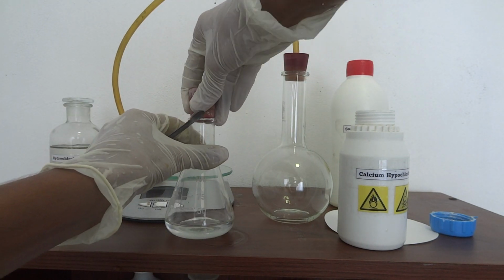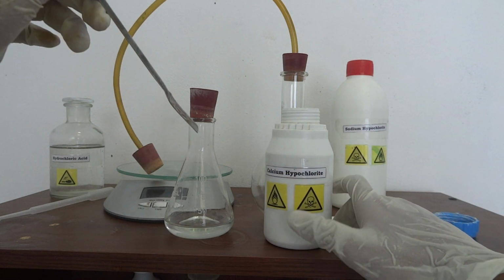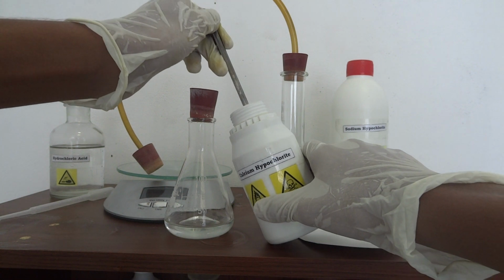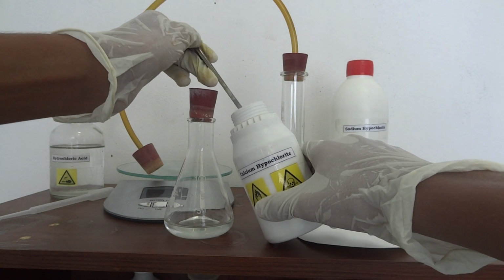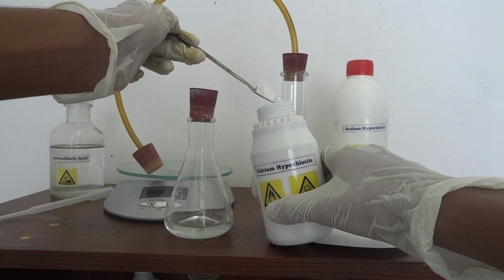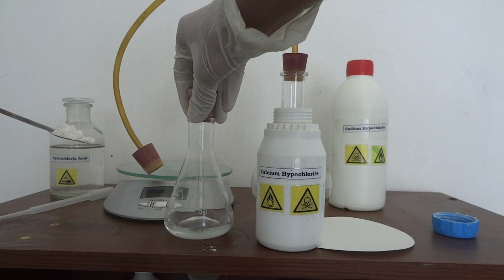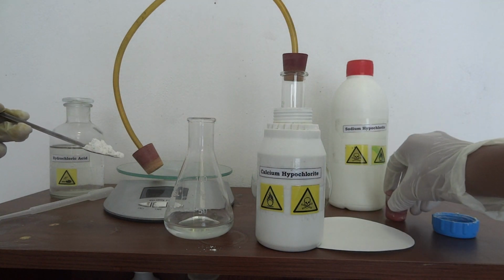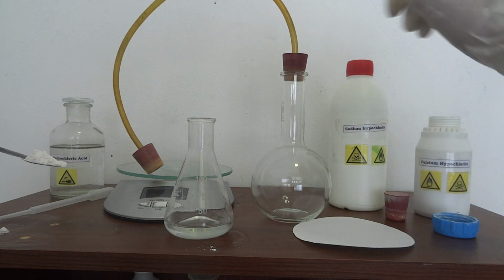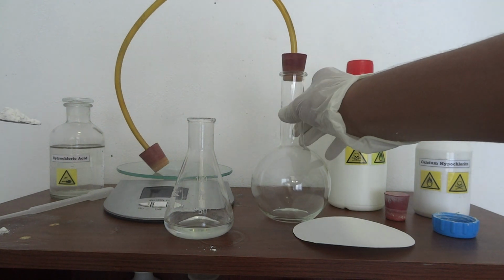You should be real quick in here, because as soon as the calcium hypochlorite touches the hydrochloric acid, it will start producing a crazy amount of chlorine gas. You can see there is white color powder. And slowly in it goes.